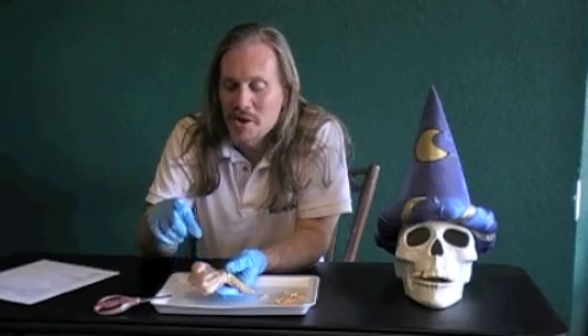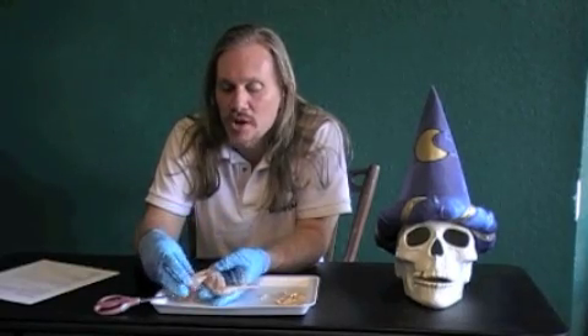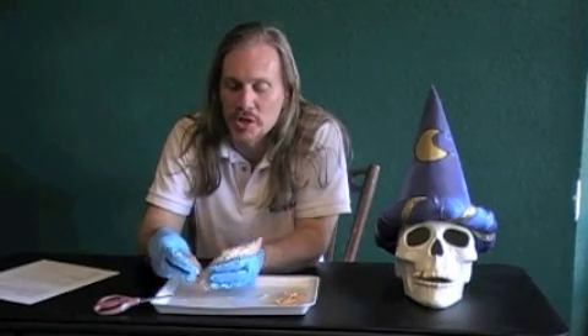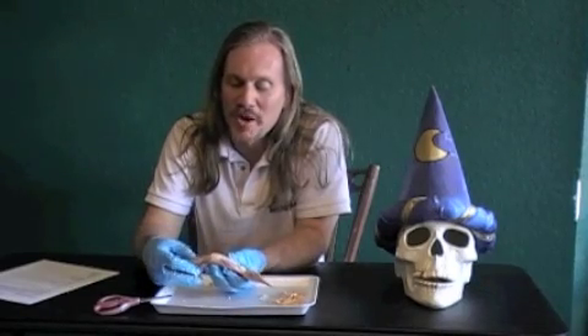Once you have your chicken wing skinned - and hopefully you got it skinned with no injuries involved - you can see the actual muscles that are underneath the skin. Because the muscles are kind of hidden when you look at the skin, but once you remove that skin you can see the actual muscles. You can see the biceps and triceps down here.